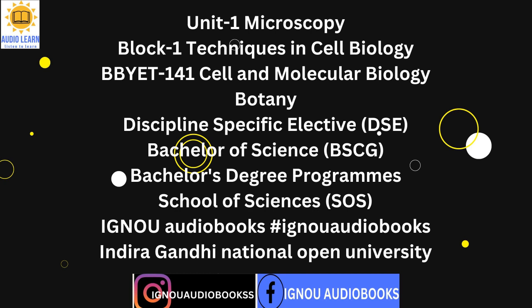Block 1 Techniques in Cell Biology. Unit 1 Microscopy. 1.1 Introduction. Cell biology is the branch of biology which deals with the study of cell structure, their architectural details, major cellular as well as subcellular processes, and the interactive processes between the cells.